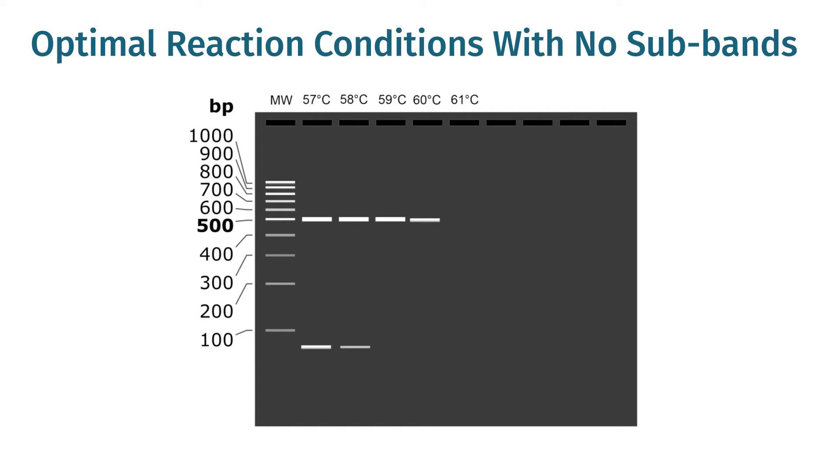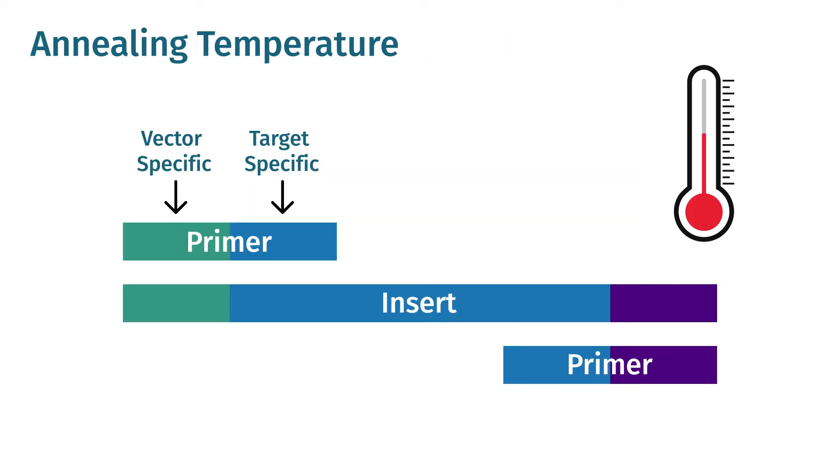In addition, optimize reaction conditions so that there are minimal sub-bands or PCR artifacts present in your PCR reactions. Finally, set your annealing temperature based on the target-specific portion of your primers.